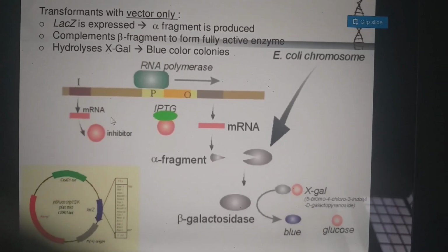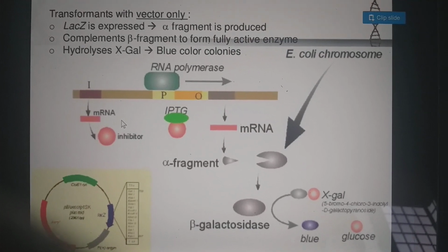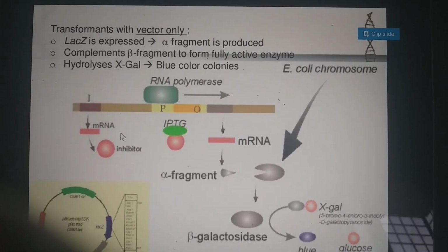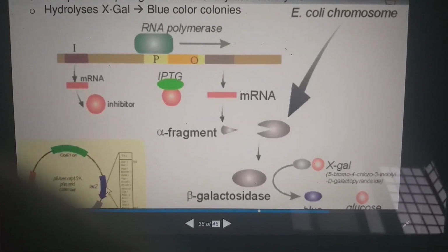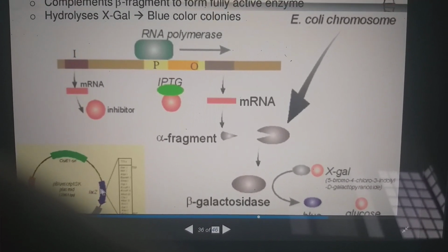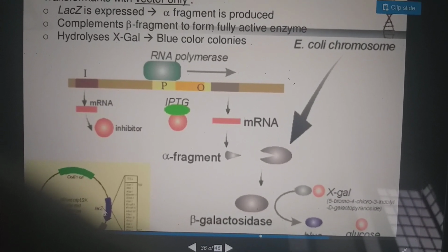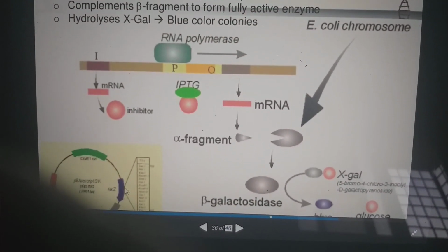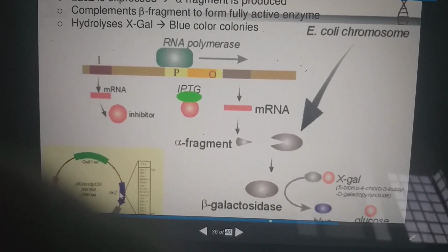Yes, there are two possibilities. Either your foreign gene will get inserted in lacZ. Yes, this is the cutting site. There are two possibilities. Either your foreign gene will get inserted in this vector, or it will not get inserted, right?